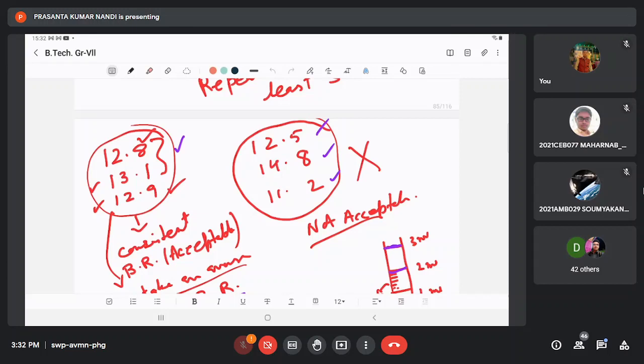you obtain 14.8. And in the third titration, third chance, you obtain say reading 11.2. Now the question is, is it reliable? All these data, are they reliable or not? How do you justify? Because none of the data matches; at least out of three, two should be in close agreement. But you see, none of the data are in close agreement. They differ significantly by more than one unit to two units like that. So that means these titrations that you did in the laboratory are not correct.